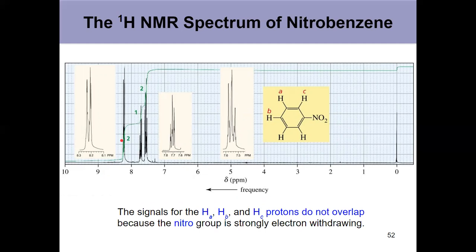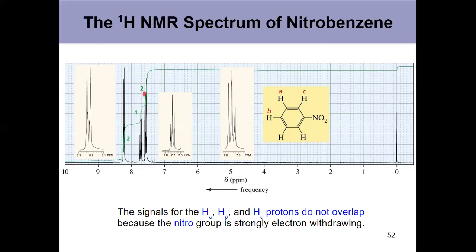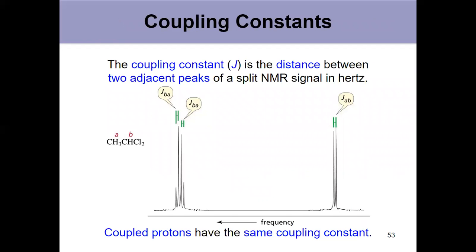We can see them. They've been resolved on the spectrum. They're not overlapping one another. So we get signals for each, right? A doublet, a triplet, and then all the way on the right over here, a doublet of doublets, okay? Because A is being split by 2 non-equivalent protons, which we started the video with. And the specific way that these things split does give us some valuable information. We can get a lot, right? We talked about mutual coupling, right?